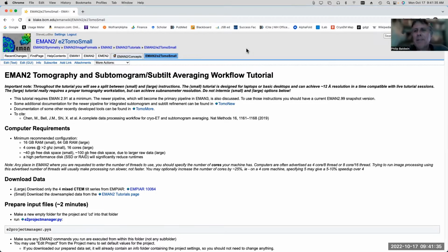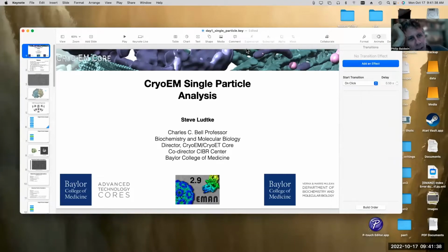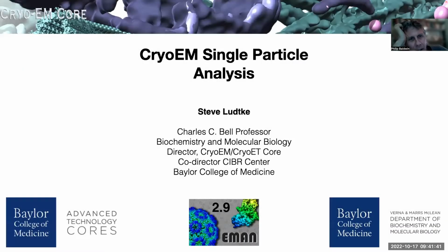So I've just one other comment. What I found with the tutorials is they're very clear and very good, but it's not always easy to get the sought after resolutions. So maybe as we go through it, you can suggest certain standards, certain checkpoints. Like at this point, it really needs to be of such and such a quality. I think the single particle tutorial at least does that. It has a sequence of resolutions that you're trying to achieve, and it sort of shows you what it should look like in most cases.